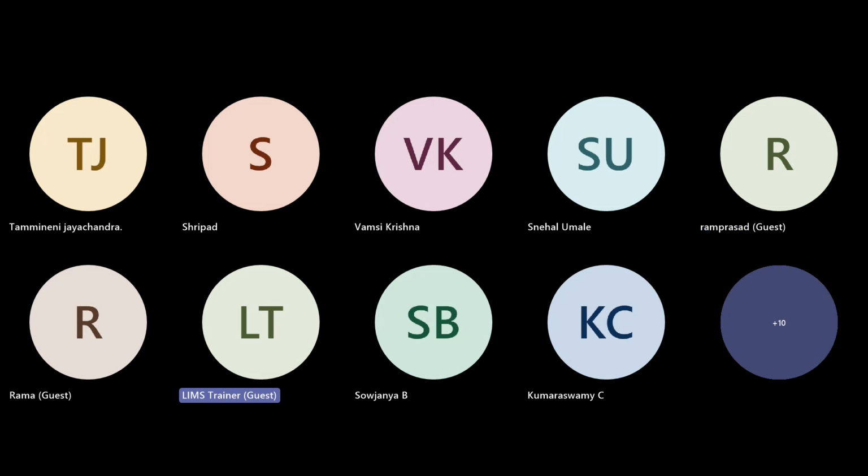If you come to advanced level, there is LIMS basic code. LIMS basic code means for LabWare, they have one particular set of coding language. That comes under another topic and another course, to be very honest. But yes, if time permits, I want to cover something here.